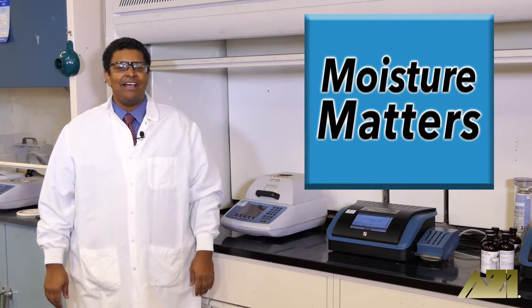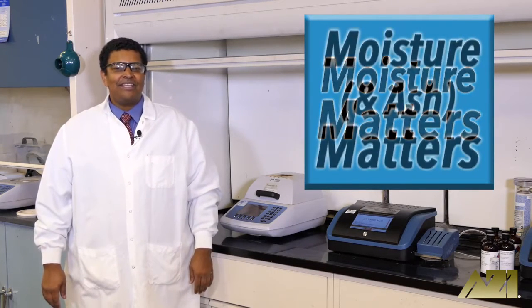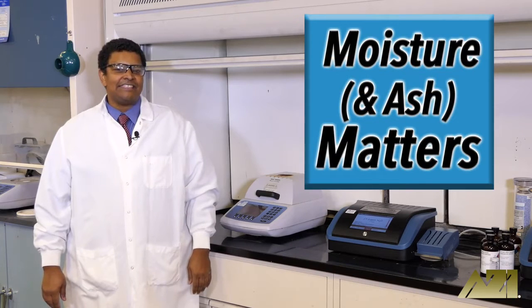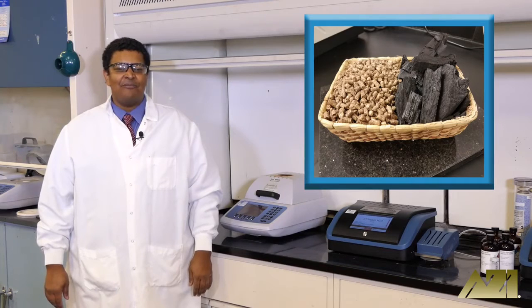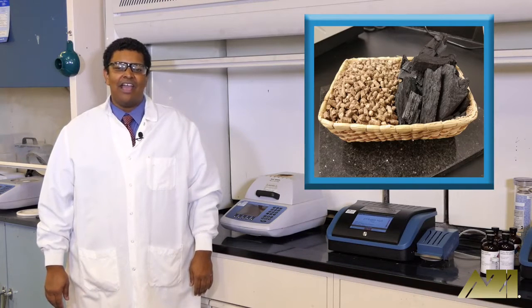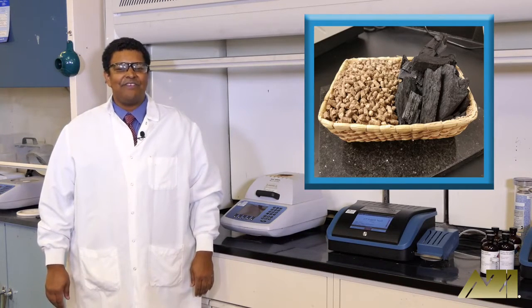Today we'll be doing something a little bit different. We're testing the moisture content and ash content of wood pellets and lump charcoal. So which do you think will have more moisture and which do you think will have a higher ash content? Let's find out.